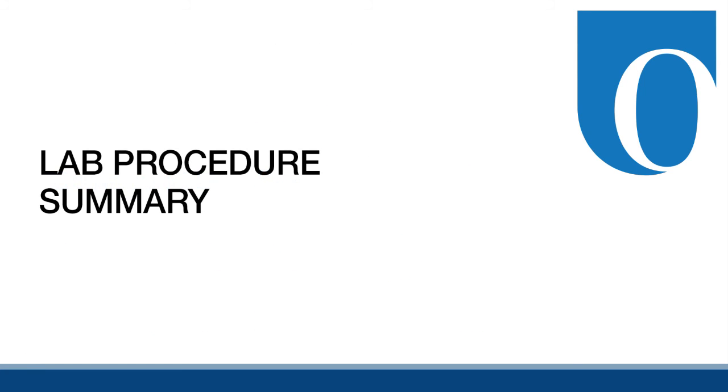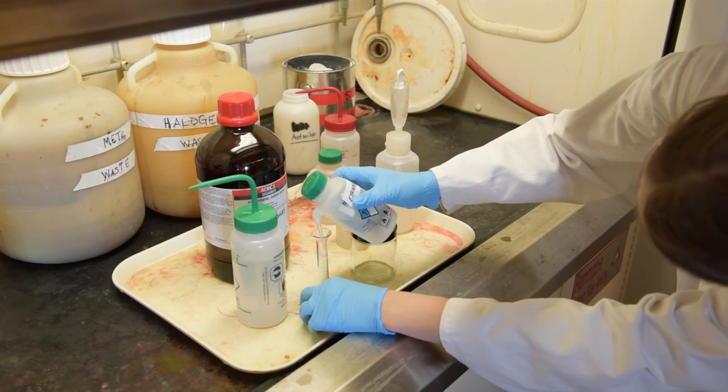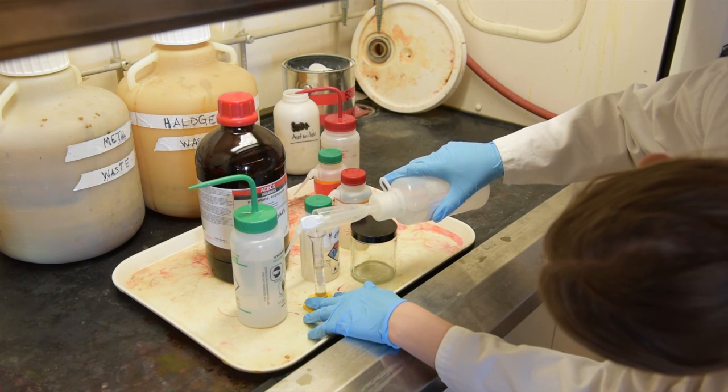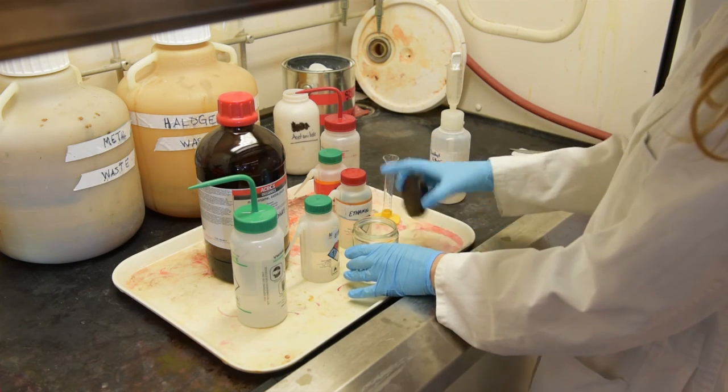So to recap, first prepare your mobile phase by measuring 4 milliliters of ethanol into a 10 milliliter graduated cylinder and then fill to the 10 milliliter mark with diethyl ether. Pour the solution into a TLC jar and close the lid.